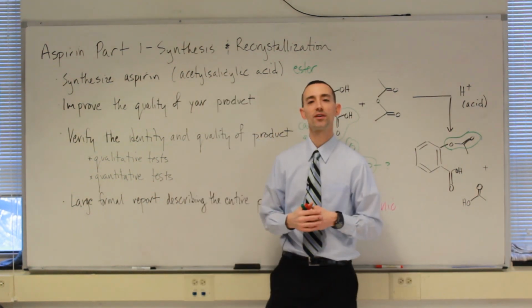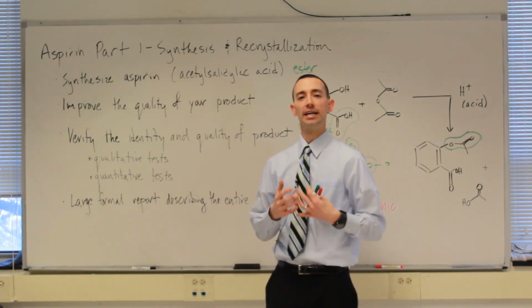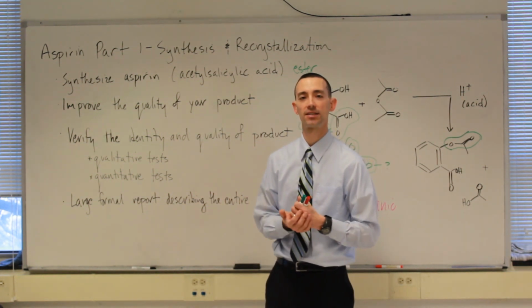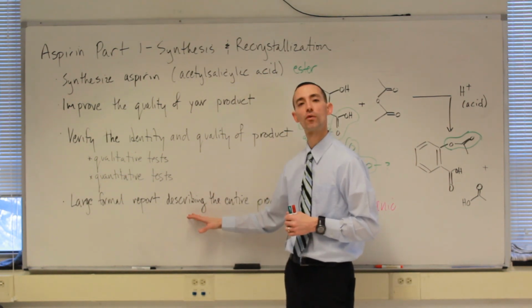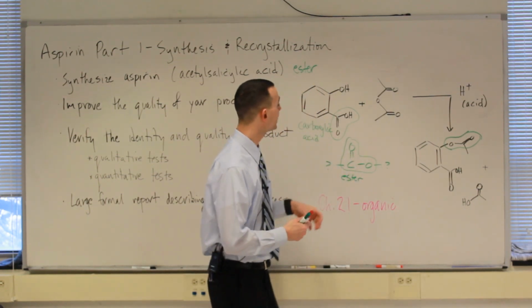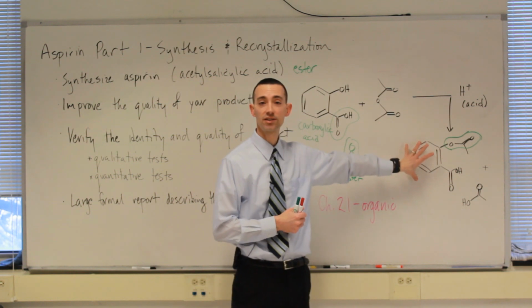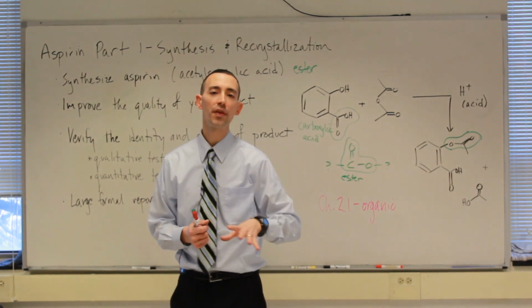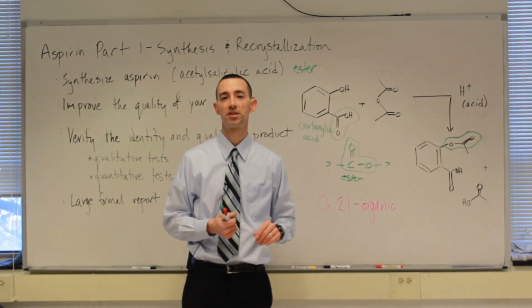Okay? A couple of final notes for today. Number one, take good descriptive notes when you can throughout the process. You're going to be asked, as part of this large formal report that you're doing, to demonstrate that you really did take salicylic acid and turn it into acetyl salicylic acid. A student who's rushing will think that these two compounds are just both white, powdery substances.